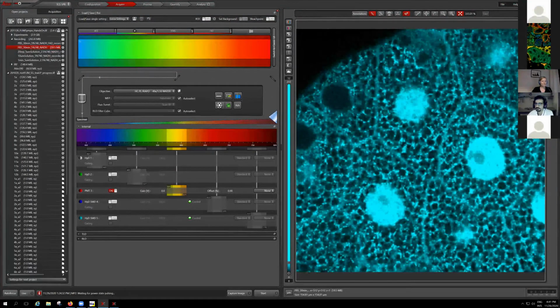Sorry, excuse me, I missed the question. So we were just discussing whether you need it when you want to do a phasor analysis, and I think probably not. In my case, as I said in the morning, I'm not really interested in knowing the precise lifetime. Whatever it does is just introduce a small bias, but the bias will affect everyone equally.